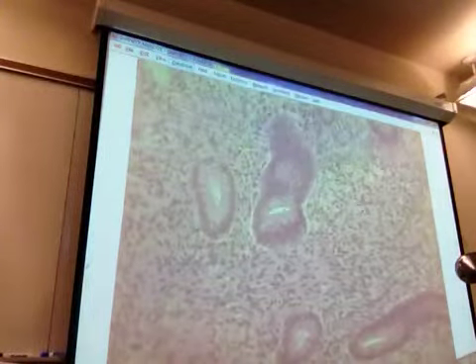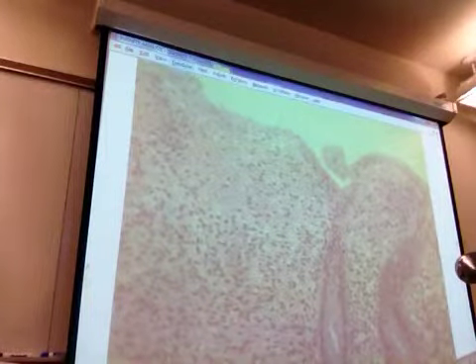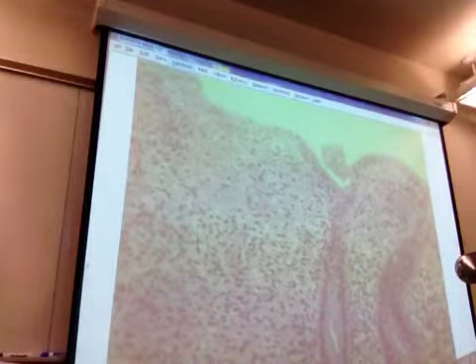Yeah. And it's also what's in one of your book diagrams. Good. So, yeah, it was simple columnar. I had to remember that. And that's what it looks like, so good. Yep. Pretty much everywhere. It's actually simple columnar in the fallopian tubes too, but there's cilia there.